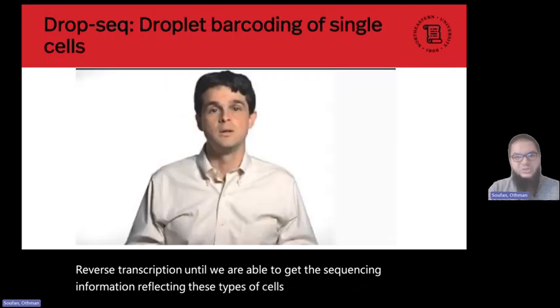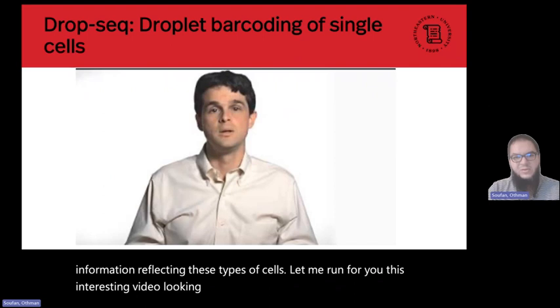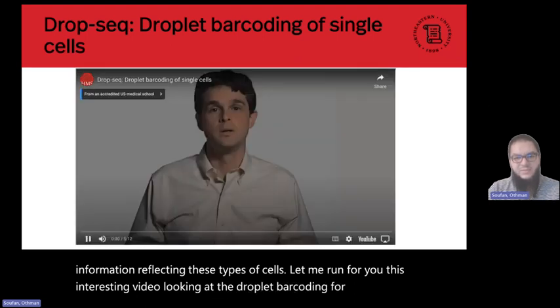Let me run for you this interesting video looking at the droplet barcoding for single cell.